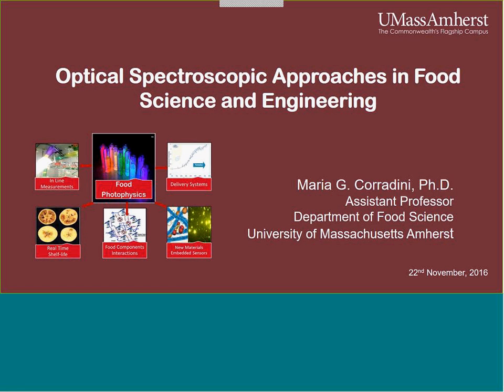During this presentation, I will introduce a diverse set of optical approaches that can contribute to research and development, as well as quality control in food science and engineering. These optical approaches mostly revolve around the use of luminescence spectroscopy and fluorescence microscopy, and the examples that I'm presenting correspond to applications developed by me and my collaborators. Let's start first by making a case for luminescence spectroscopy in food applications.